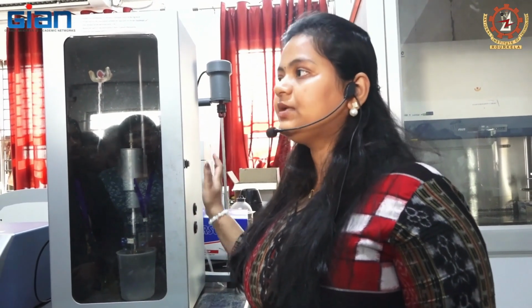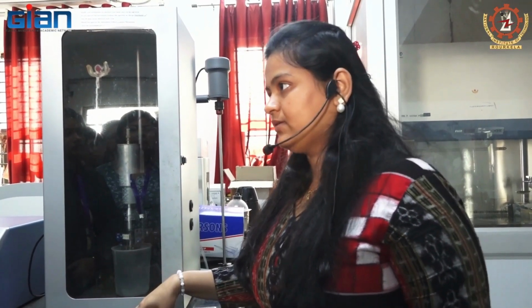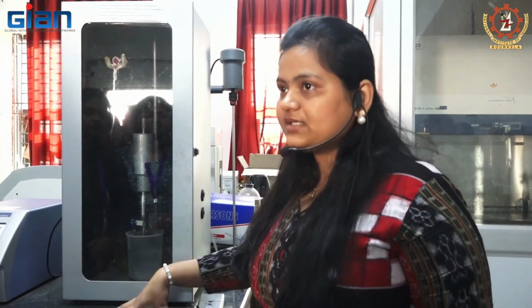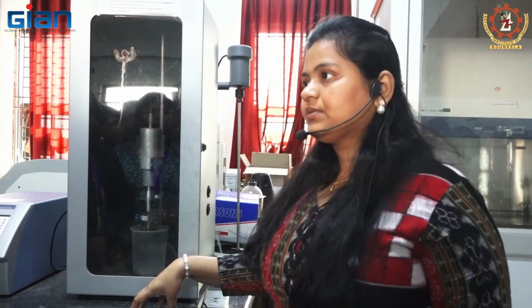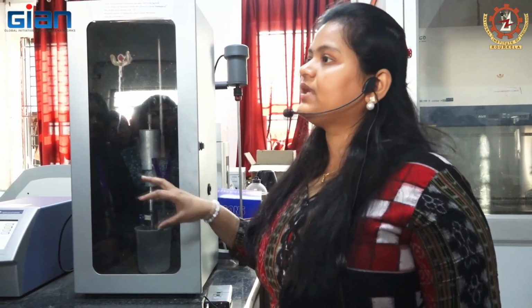Okay, in industrial scales it cannot be operated till now, because of the investment cost, the capital cost, and also energy, because it will take a high electric field, where you need a continuous electrical supply, then it can be used.